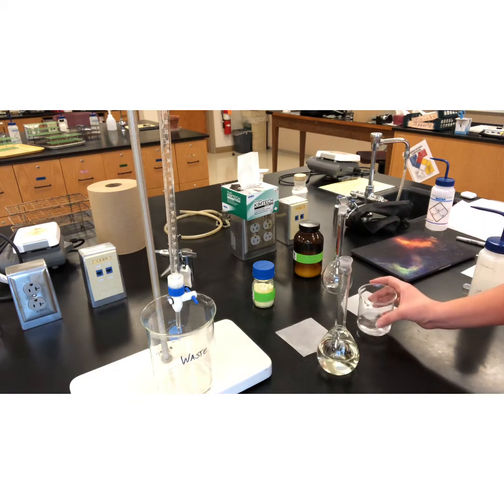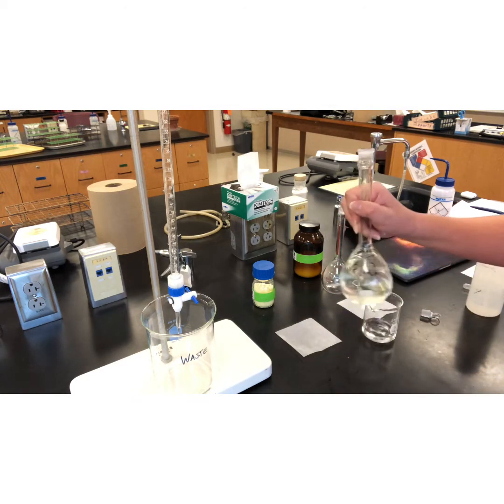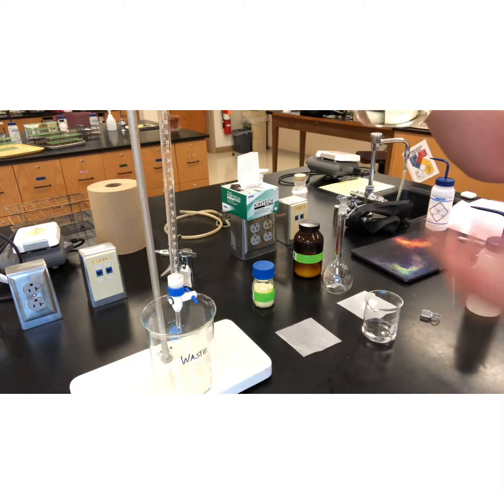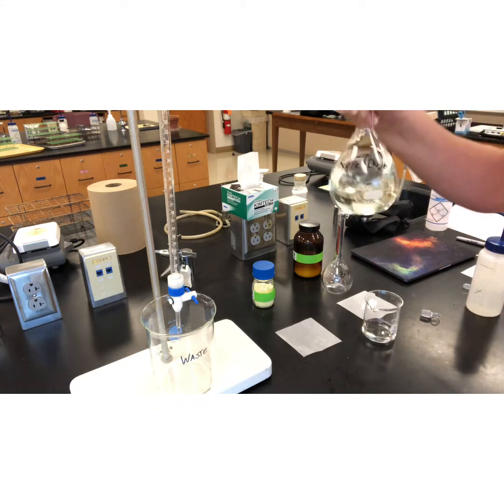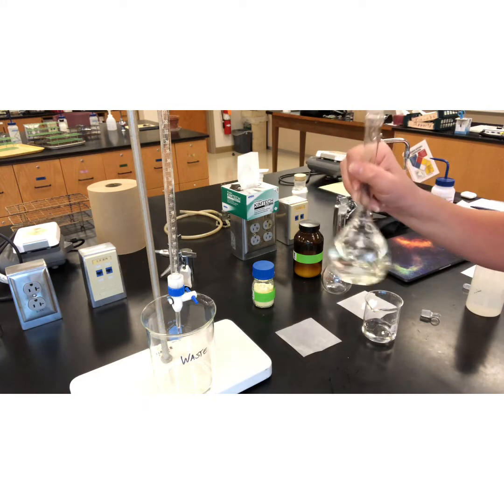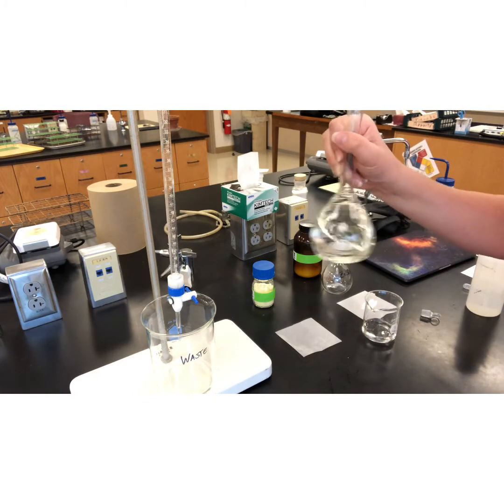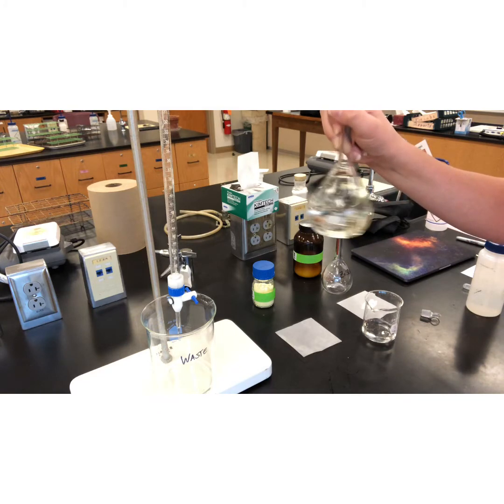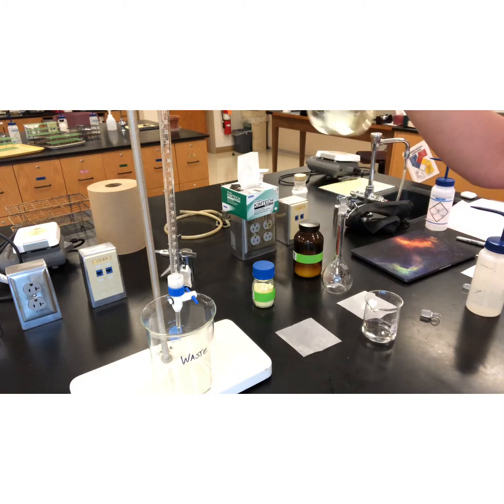All right. Quite a bit of water in there. I'm going to swirl it together. I still see a few crystals on the bottom, so I'm going to swirl it till they completely dissolve into the solution. Come on, little guys.